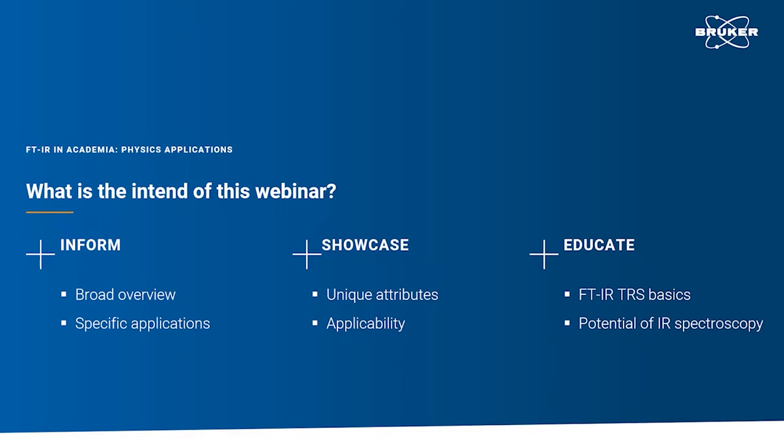How does time-resolved spectroscopy work? And when is it needed? And how is it applied in physics? Compared to other analytical methods used in physics, such as electron spectroscopy, electron microscopy, or near-field methods, FTIR is incredibly easy to use and a low-cost choice in providing more information than you expect. And at the end of the webinar, I hope we have made this clear. And with that, I kindly give the word to Xia Stammer.